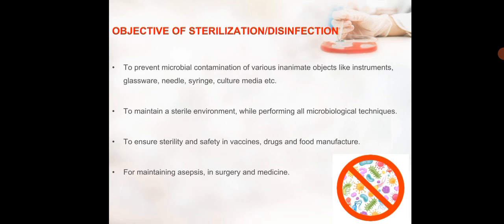Various objectives of sterilization and disinfection are to prevent microbial contamination of various inanimate objects like instruments, glassware, needles, syringes, culture media, etc. To maintain a sterile environment while performing all microbiological techniques. To ensure sterility and safety in vaccines, drug and food manufacture. And for maintaining asepsis in surgery and medicine.